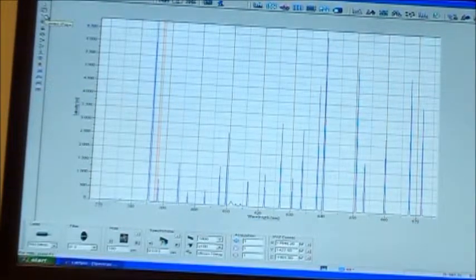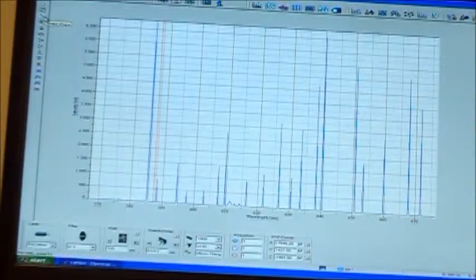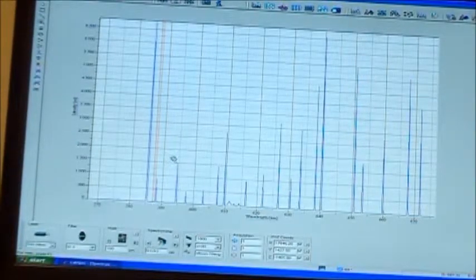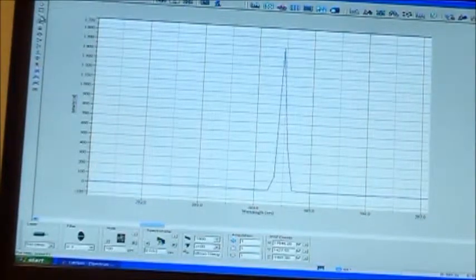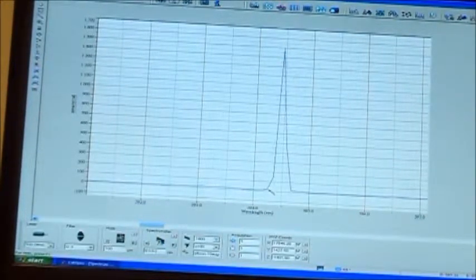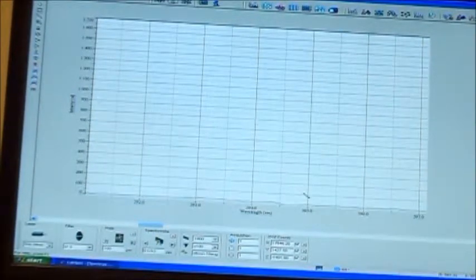Next one down looks like a little pencil. It's called the shape corrector tool. Once again, if you have a peak that is a solar spike and you want to get rid of it, you can zoom in on the peak and use your shape corrector tool, and you can just drag this pen across the bottom of the peak and the peak will disappear.